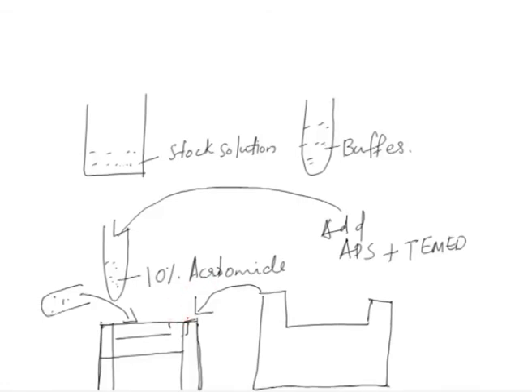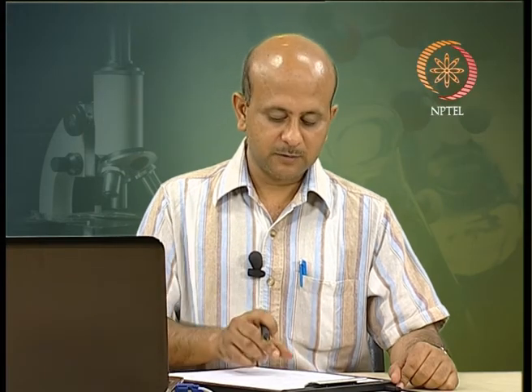You can put, say, a layer of organic solvent on top of it, just to make a uniform shape here, rather than disturb bed above bed, and then finally it will solidify very fast, in say 15, 20 or 30 minutes. Once it is casted, it will be put into the running apparatus, which contains electrodes, a place for electrode buffers and so on.